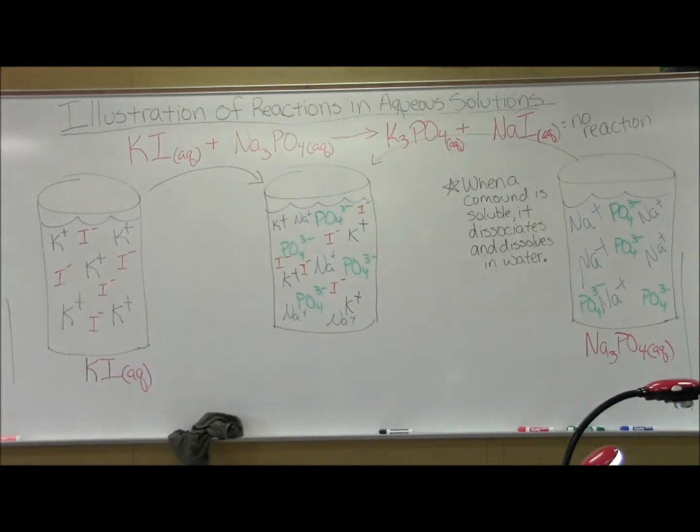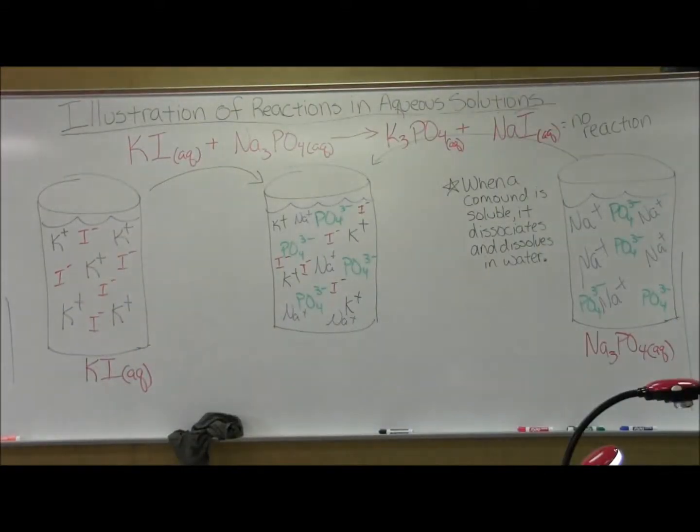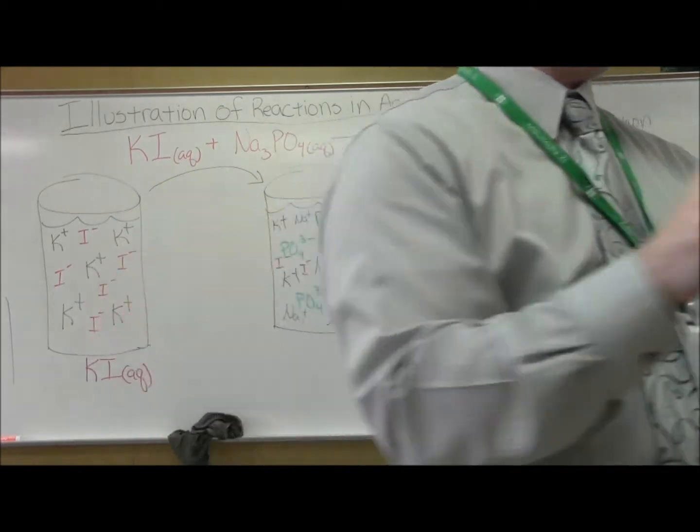Other classes I turn the lights off and show it on the overhead, but that won't work with the video camera. Okay. Everyone there, clear liquid, no reaction.